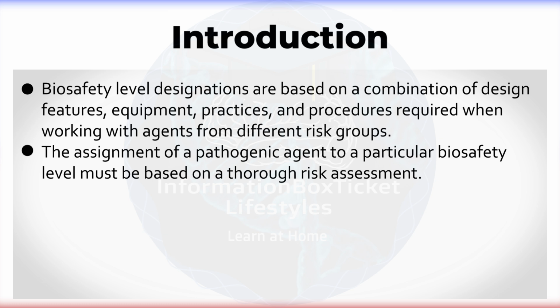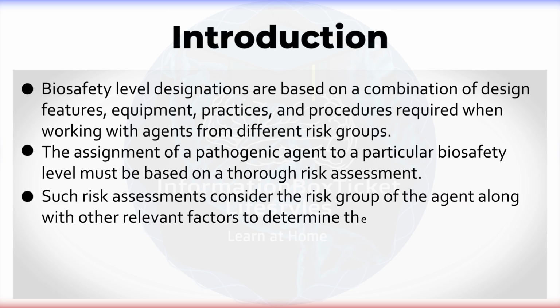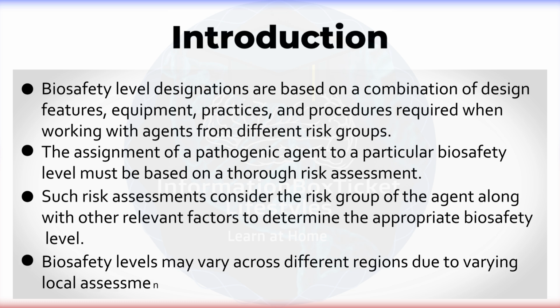The assignment of a pathogenic agent to a particular biosafety level must be based on a thorough risk assessment. Such risk assessments consider the risk group of the agent, along with other relevant factors to determine the appropriate biosafety level.